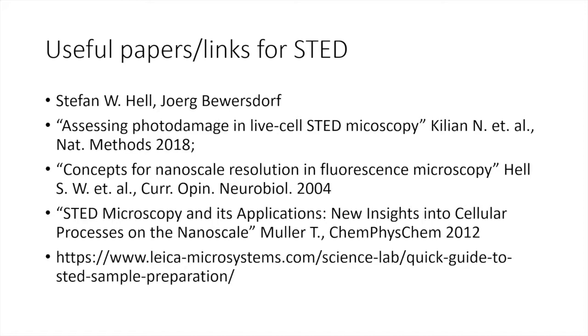And the Leica website has very practical points that you can start from: choosing your dye, choosing your laser, and how to prep your sample.